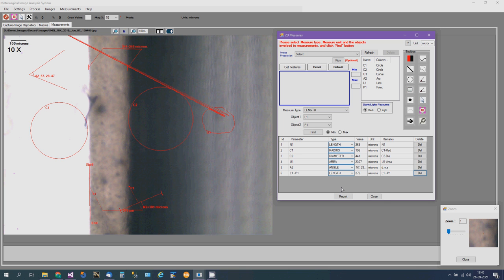Okay, you need to go in detail and experiment with the different features that we have. Basically, either you can directly measure it, or you select the distance between. So you have two options to find out the 2D measurements.